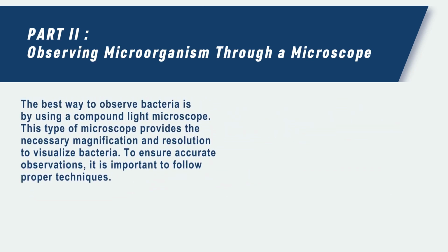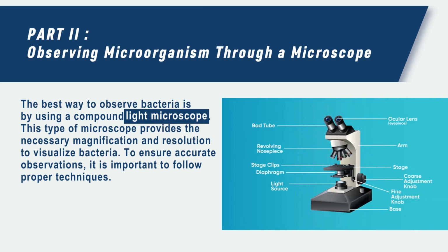The best way to observe bacteria is by using a compound light microscope. This type of microscope provides the necessary magnification and resolution to visualize bacteria. To ensure accurate observations, it is important to follow proper techniques.